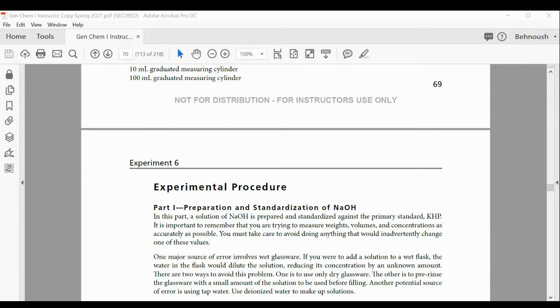So if you have 10 milliliters of the acid mixed with the antacid, when the reaction takes place, some of the acid that you have added is going to neutralize the antacid, and some acid would be left over. Now, when you do a titration to find how much HCl is left over, that is called back titration. So you use extra acid to neutralize the base in a flask. Then you do a titration to find out how much acid is left over. Then you subtract what is left over from the total, and you find out how much has been consumed to neutralize the antacid that you started with.